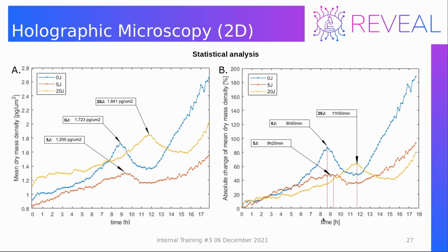This is another analysis that we did. It's a paper that we will publish, I hope, soon. We are answering the reviews right now. What we did here is we analyzed biological cells that underwent irradiation with light with very specific dosage of energy. This is called biochemical interaction between light and tissue.